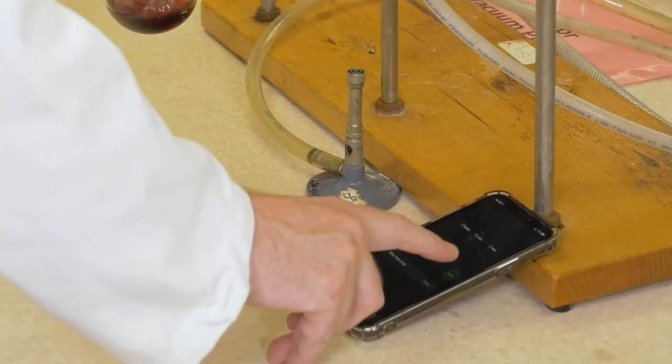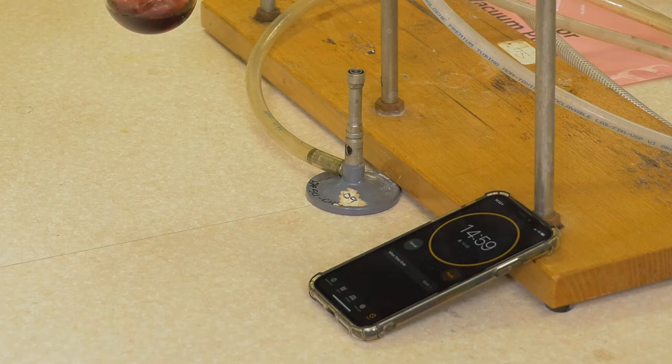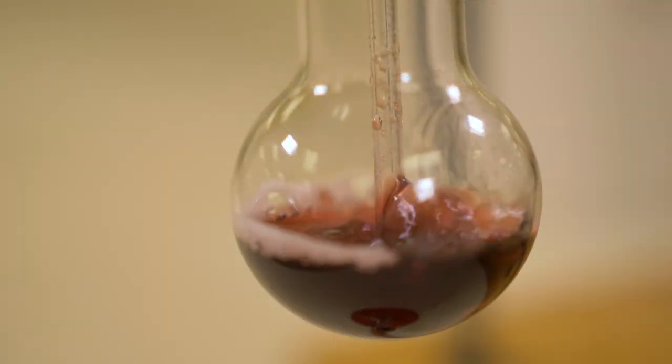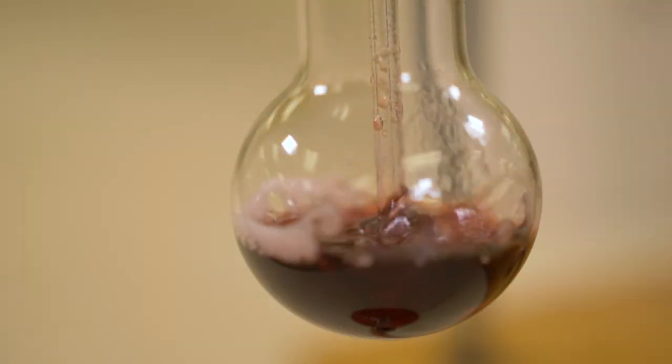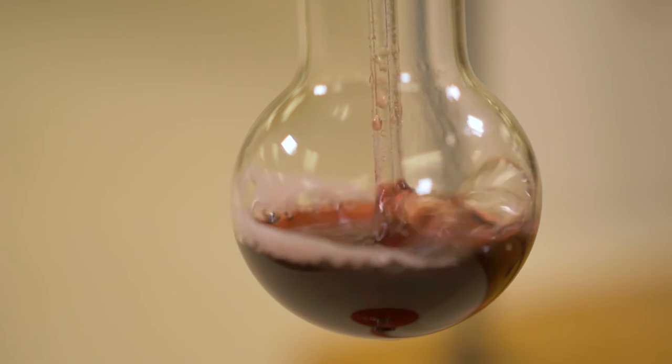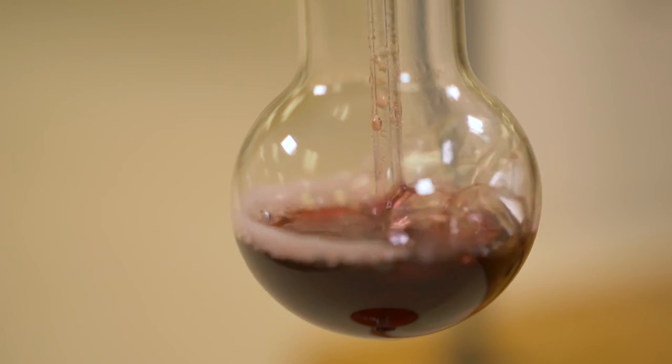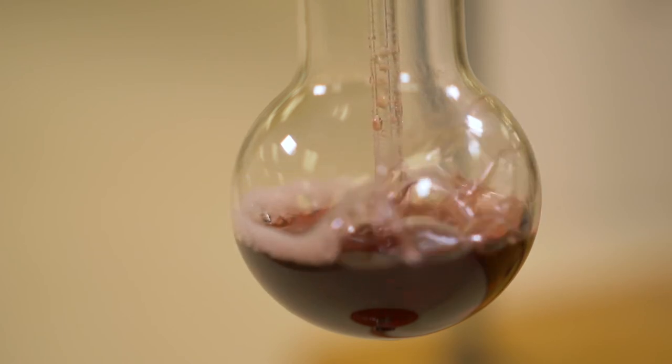The air is allowed to pass through the solution for 15 minutes to ensure that all the free sulfur dioxide has been removed from the sample to the hydrogen peroxide. Take note of the bubbling rate in the sample, it should look similar to this.